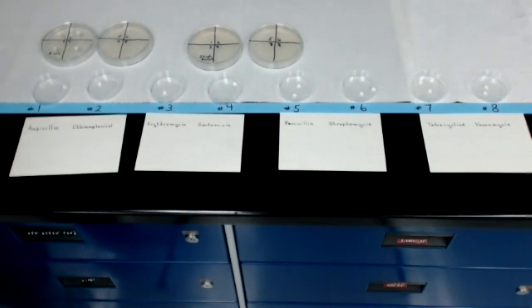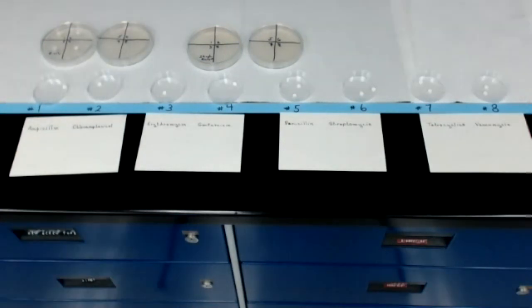After they incubate overnight, we will have to measure the zones of inhibition for each disc, and then we will need to compare the diameter of each zone of inhibition to a table that will tell us the minimum diameter necessary for the zone of inhibition to indicate sensitivity to the antibiotic. That is the end of my presentation on Module 16, Antibiotic Sensitivity.